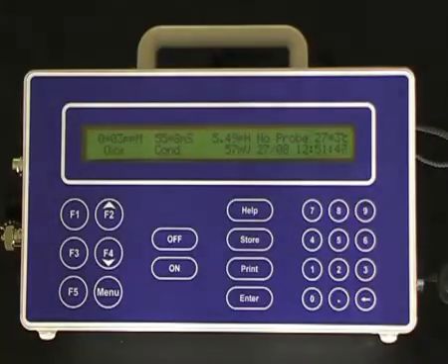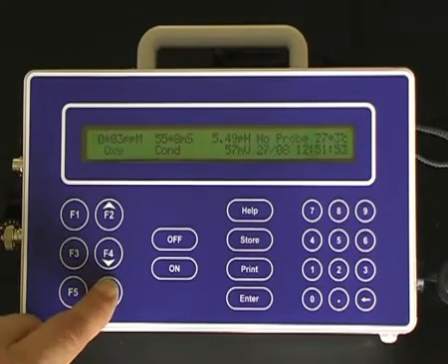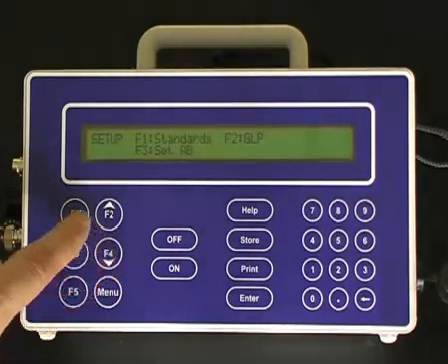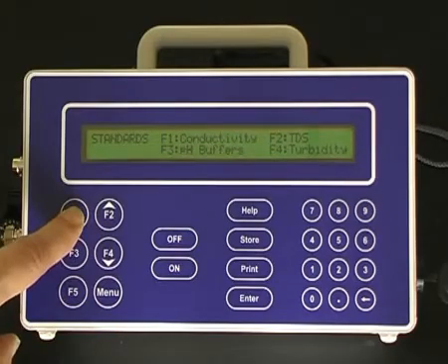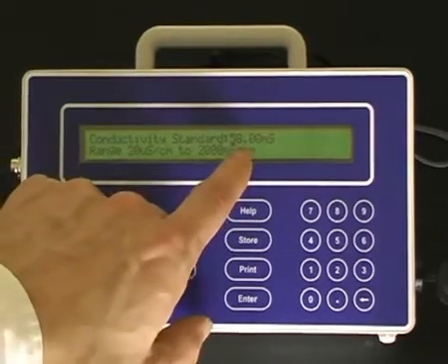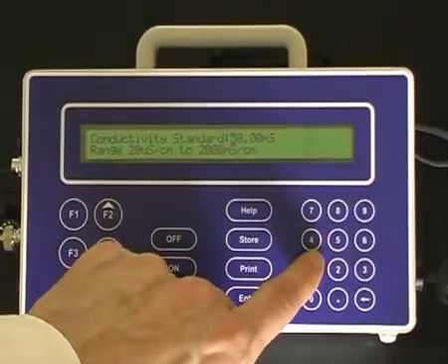Before calibrating conductivity sensors, you must first designate the concentration of the conductivity standard. Press Menu, press F4 for setup, press F1 for standards, press F1 for conductivity, and enter in the conductivity value through the keypad.